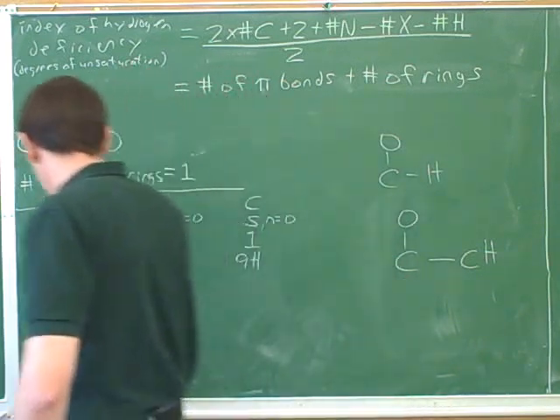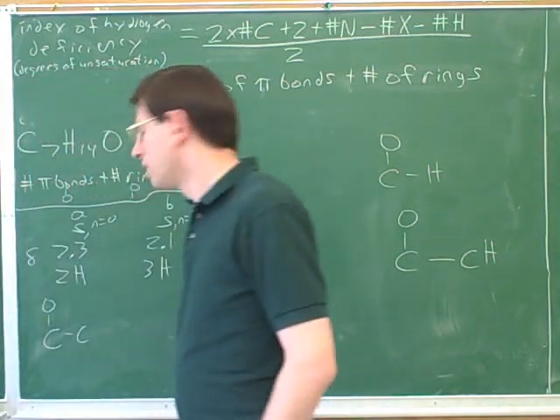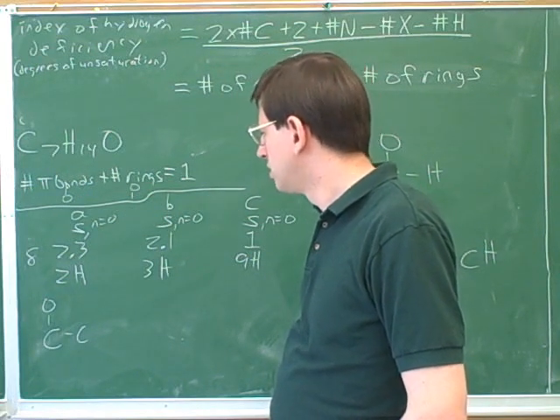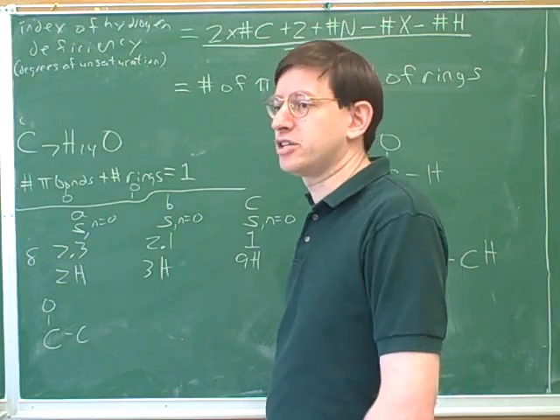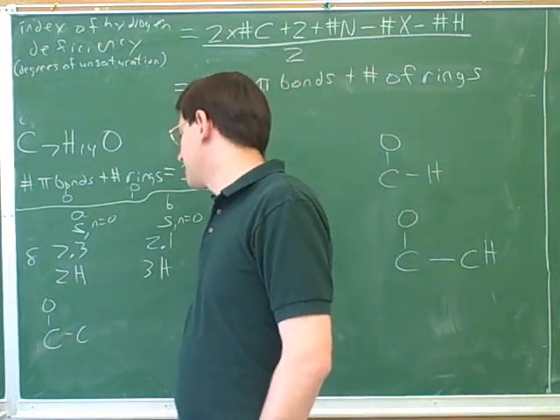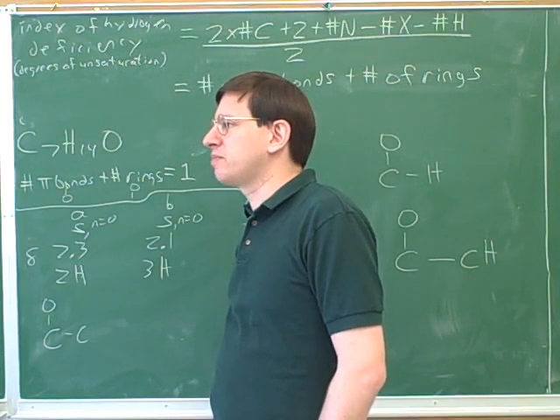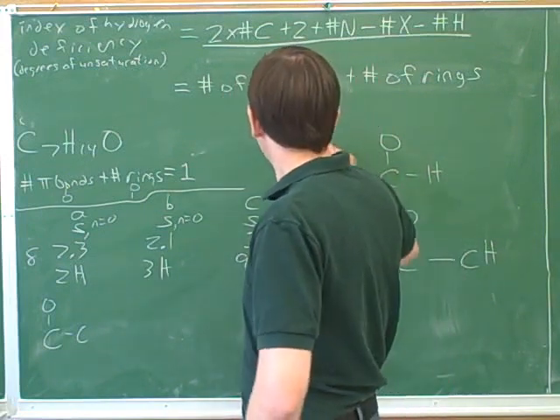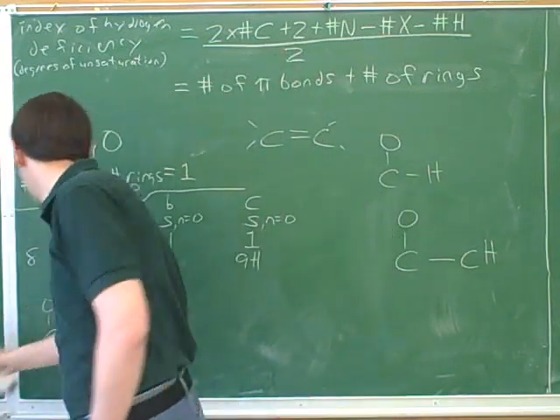Now, just really quickly to skip back to determining the hydrogen deficiency. Once we looked at our chemical shifts, do we need to take into account that it looks like we're going to have an alkane because everything's to the right of 5? Absolutely, we should certainly take that into account. So one thing we should say to ourselves is it doesn't look like there are carbon-carbon double bonds. Although it's possible that there could be an alkene, just as long as it's an alkene with no hydrogens. There could be an alkene as long as there's no hydrogens directly on the alkene. Okay. Thank you.